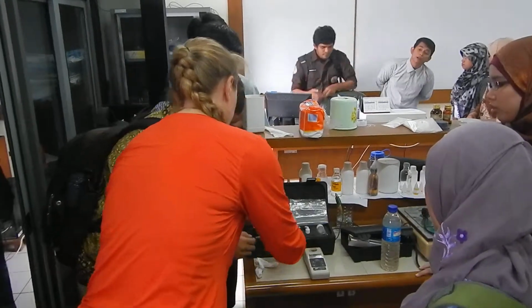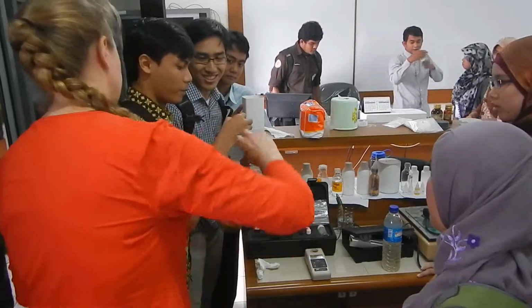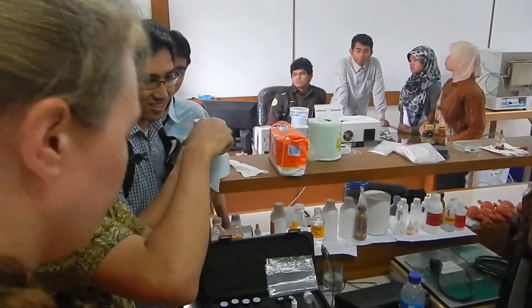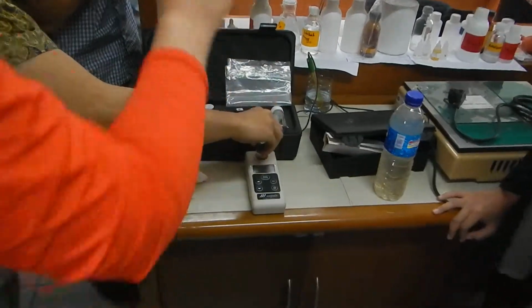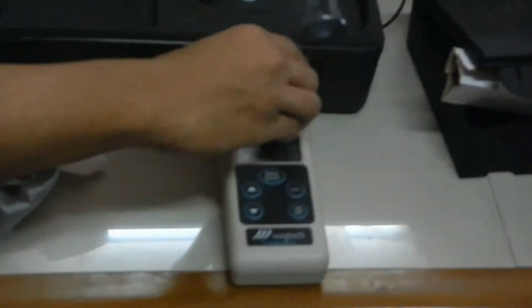So screw that one over the top, and then wipe in one direction. And then once you get that, go ahead and set it in. It's going to just hug it a little bit. It hugs it good. Now put the cap on, and then hit read.